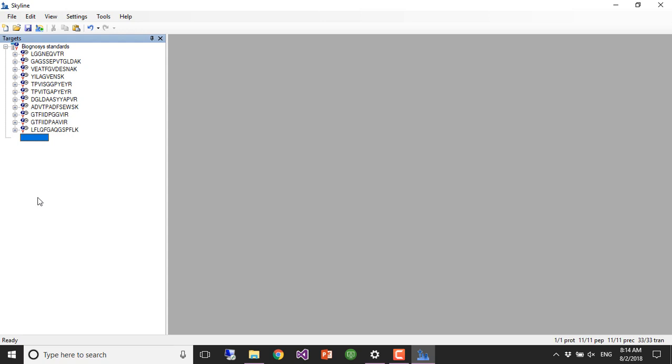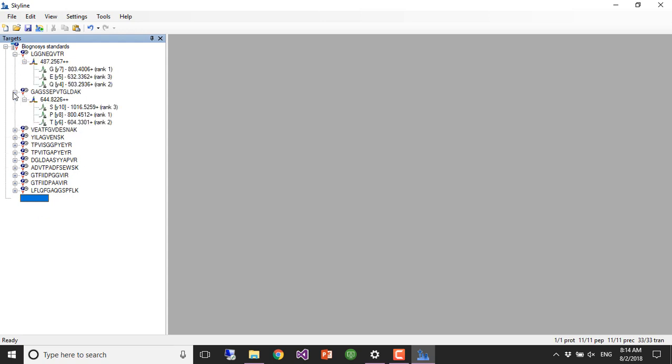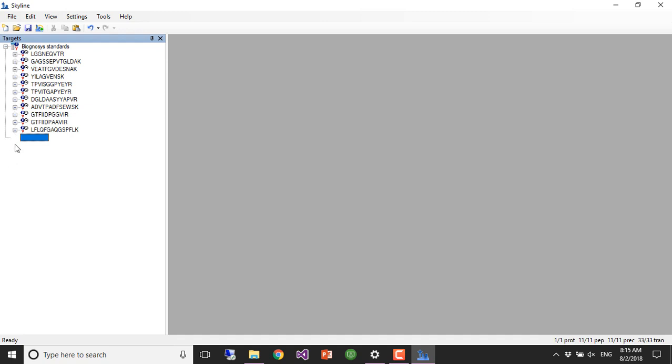It's not the official transitions. Not the official transitions? No. Okay. So you recognize them pretty well, huh? I have the iRT reference sheet on split tile. Oh, okay. All right. So yeah, I think we measured them. It looks like we measured them ourselves and chose transitions based on the spectra that we got, I guess.